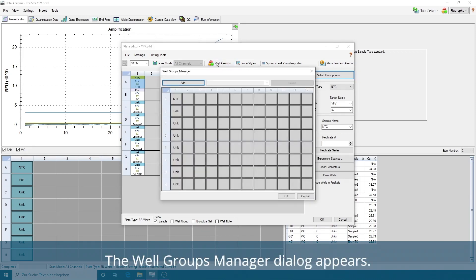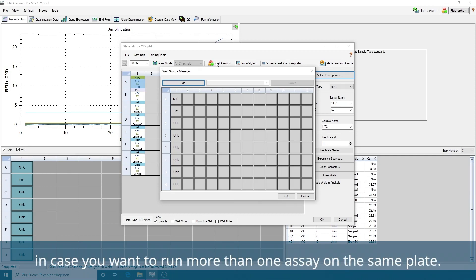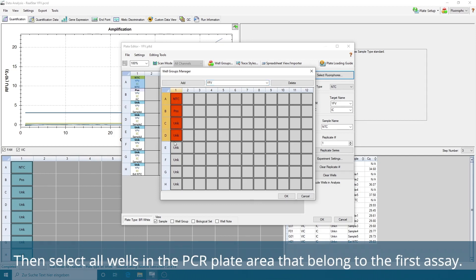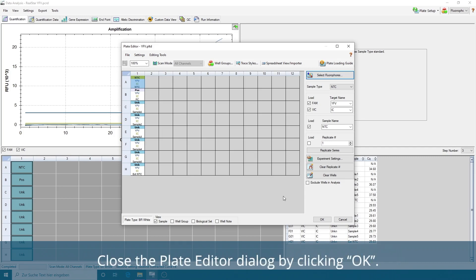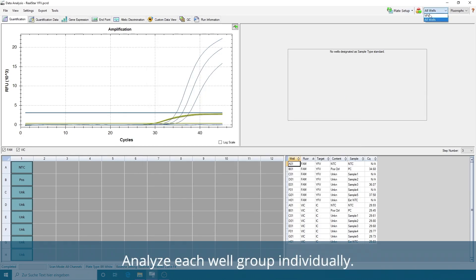Click Well Groups in the toolbar. The Well Groups Manager dialog appears. Well Groups allow you to analyze results for different assays individually in case you want to run more than one assay on the same plate. Click the Add button and type the name of the first assay in the text box. Then select all wells in the PCR plate area that belong to the first assay. Repeat this for all assays on the PCR plate, if applicable. Confirm the Well Group assignment by clicking OK. Close the Plate Editor dialog by clicking OK. Then apply the changes by clicking Yes. Analyze each well group individually.